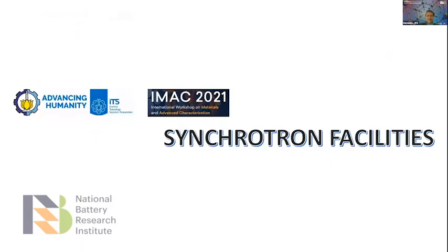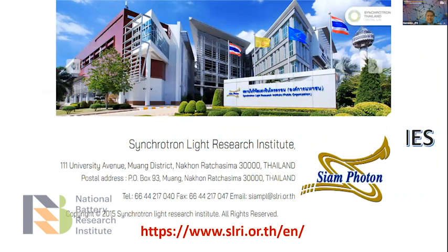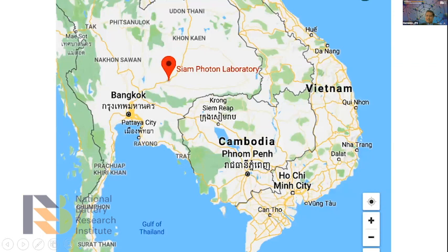Now this is the synchrotron facilities. This is the Synchrotron Light Institute in Thailand, also known as Siam Photon. Yeah, you can access this website. And since 2016, we signed an MOU with the SLRI, and afterwards, a lot of staff and students experimented there. And after the pandemic, we only send the samples and receive the data.